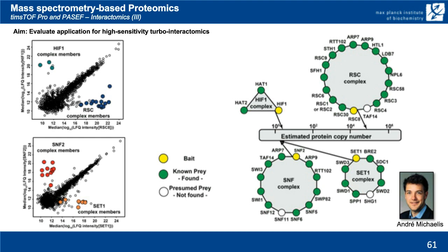And on the left side, you can see enrichments of these network interaction members in a quantitative way, plotted against each other.